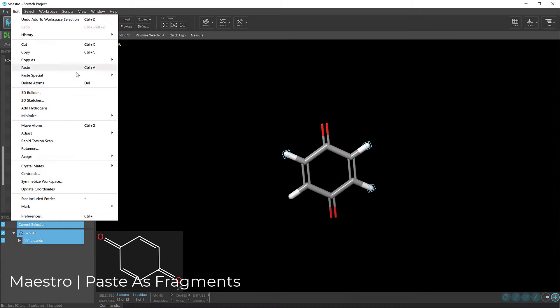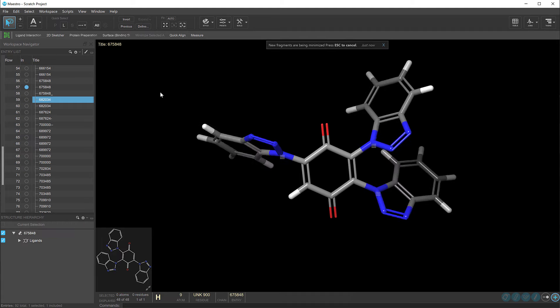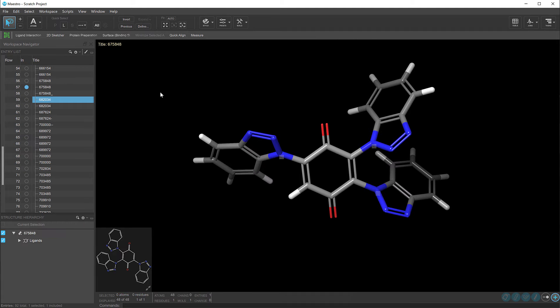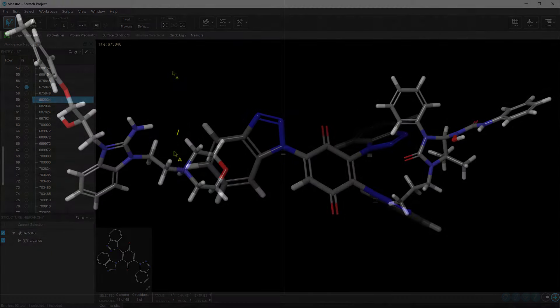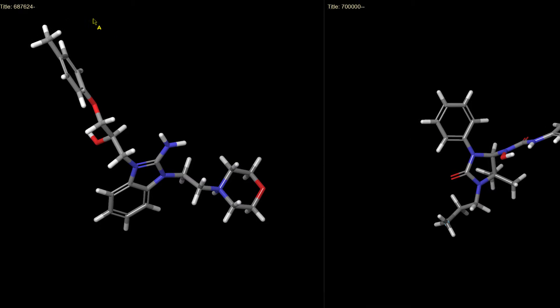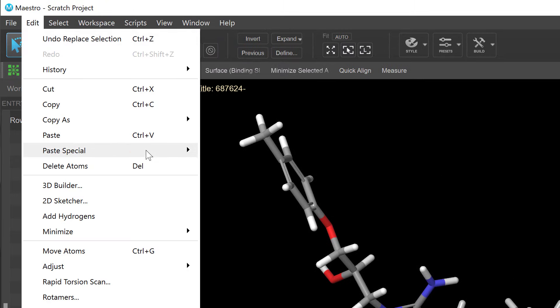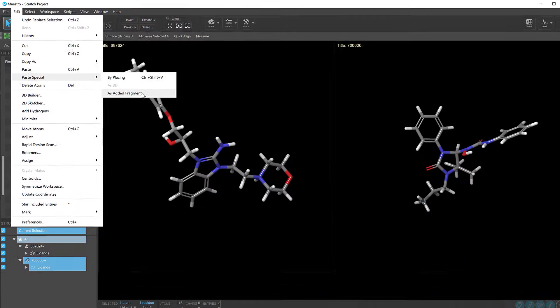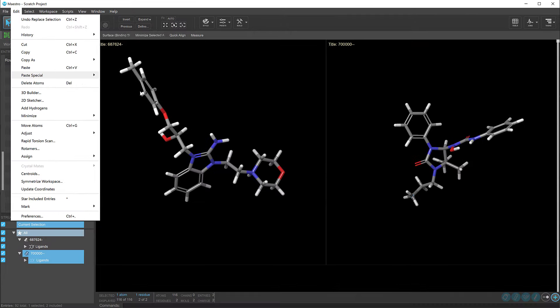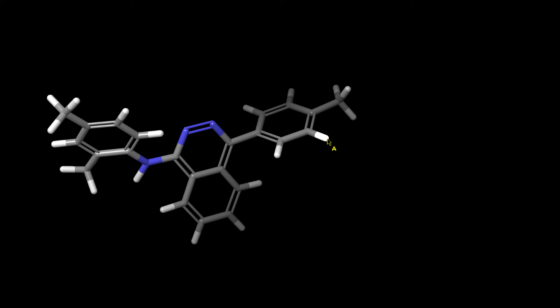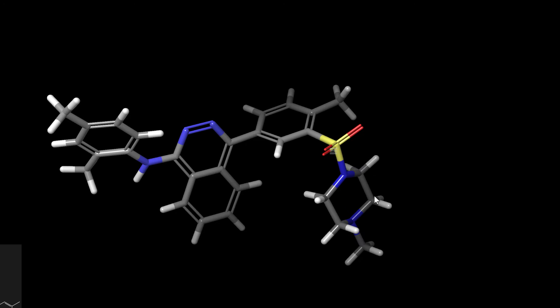In Maestro, one can now seamlessly copy fragments from existing molecules and paste them onto selected atoms in another molecule. Simply select and copy the atoms and use the Paste Special as added fragments on potential attachment atoms. This feature streamlines molecular editing tasks such as interactively copying and pasting R-groups between ligands.